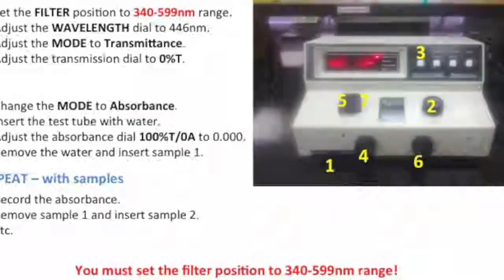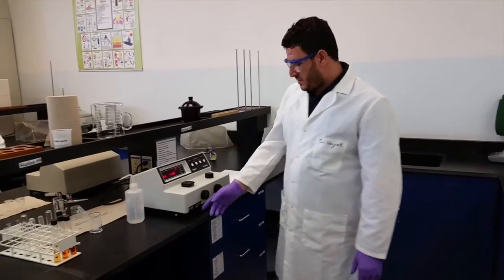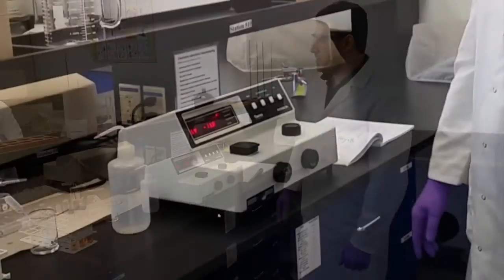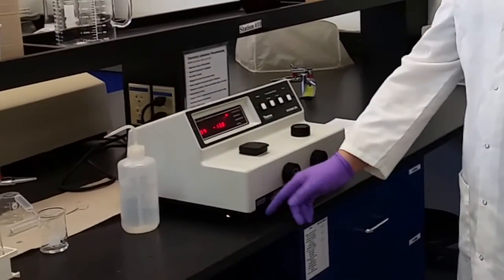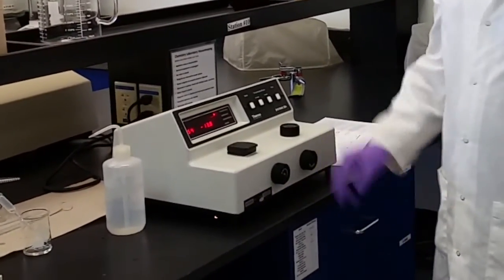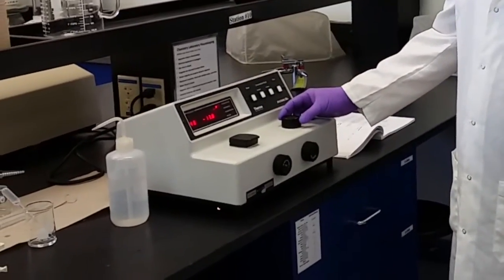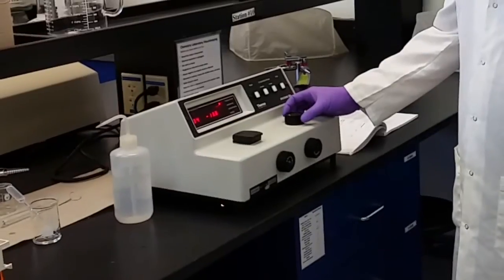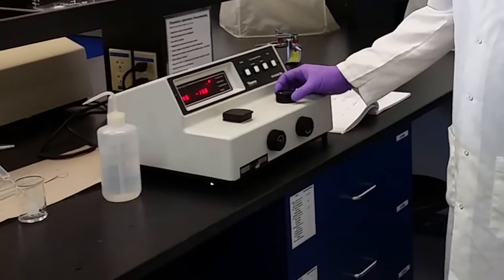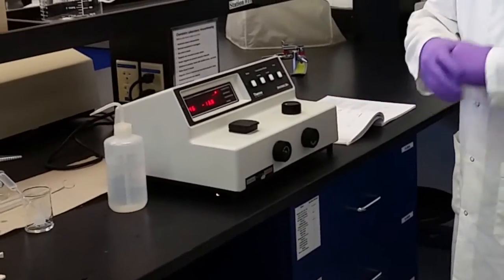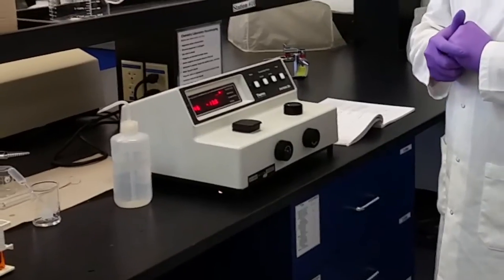You have a guideline on the screen, so just follow the steps. Set the filter position to between 340 and 599. Then set the wavelength to 446, which is the maximum wavelength of the iron thiocyanate complex ion.